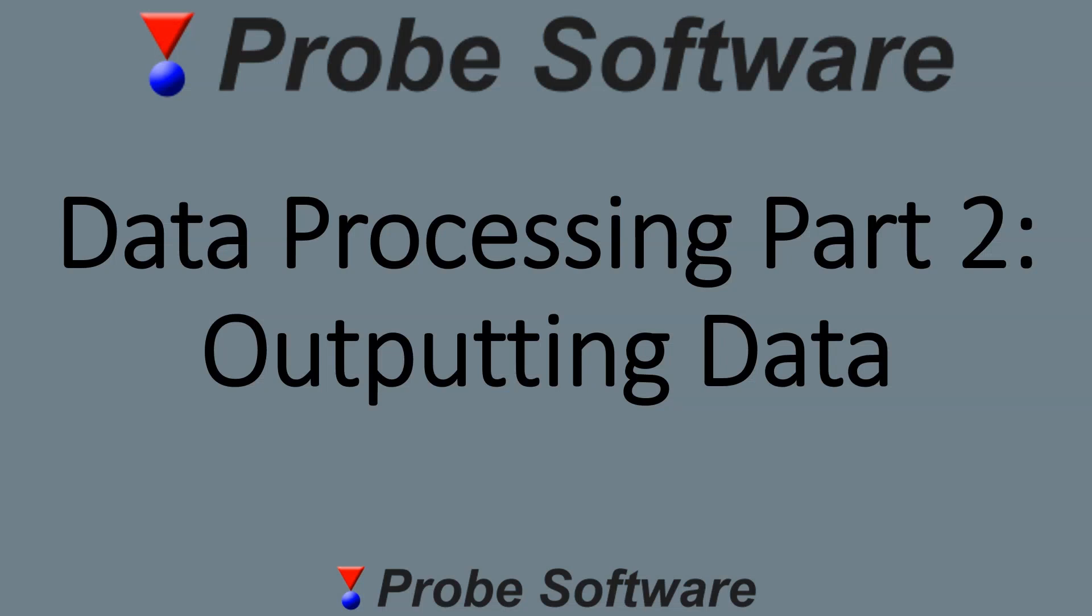In part one we looked at processing the data. In part two we're going to look at what options we have to output the data.